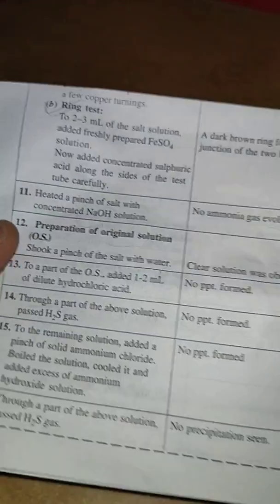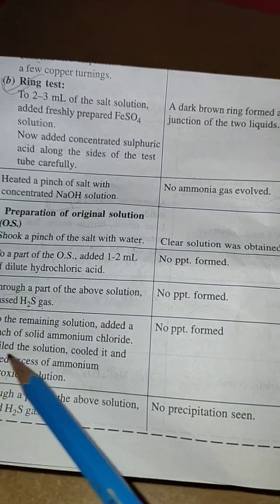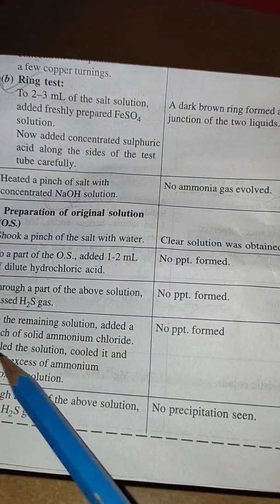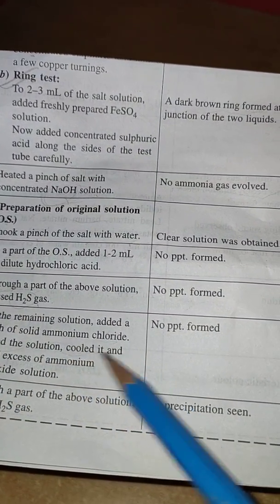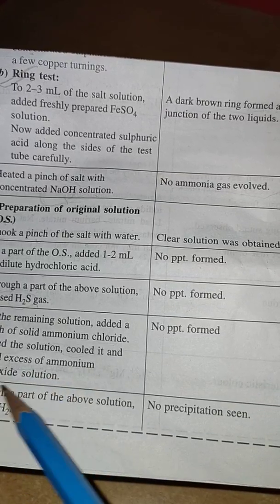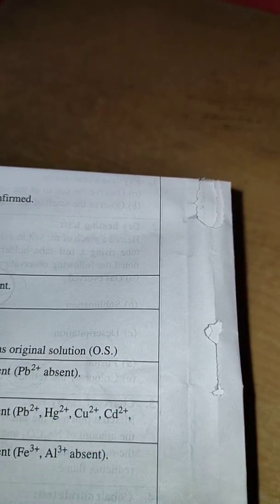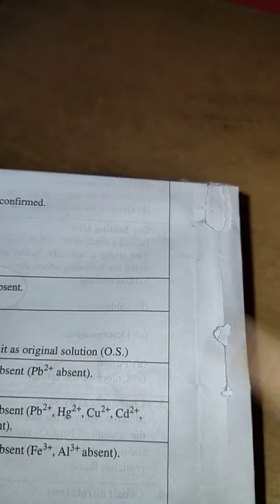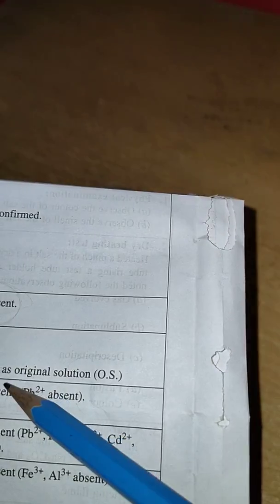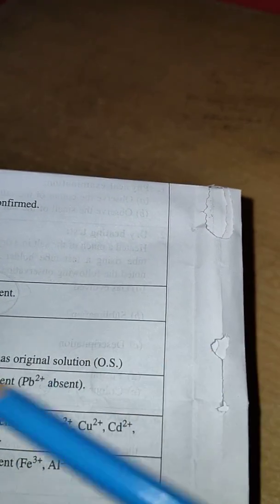To the remaining solution add a pinch of solid ammonium chloride, boil the solution, and add excess of ammonium hydroxide solution. No precipitate formed, that means group third is also absent, that is Fe³⁺, Al³⁺. All the cation parts are divided into group zero, group one, group two, group three, group four, group five. See in the lab manual how they differentiate these groups.